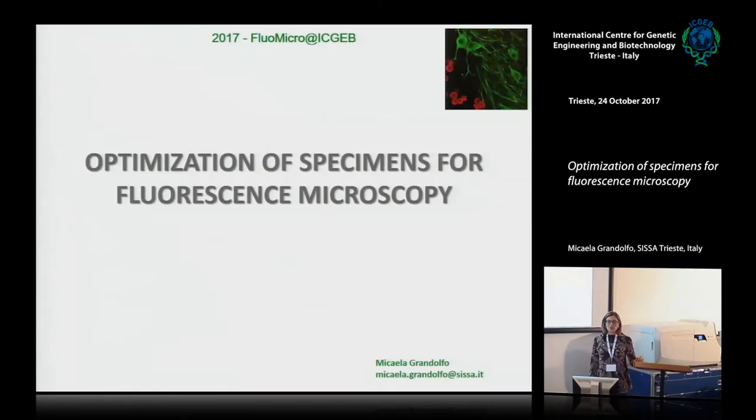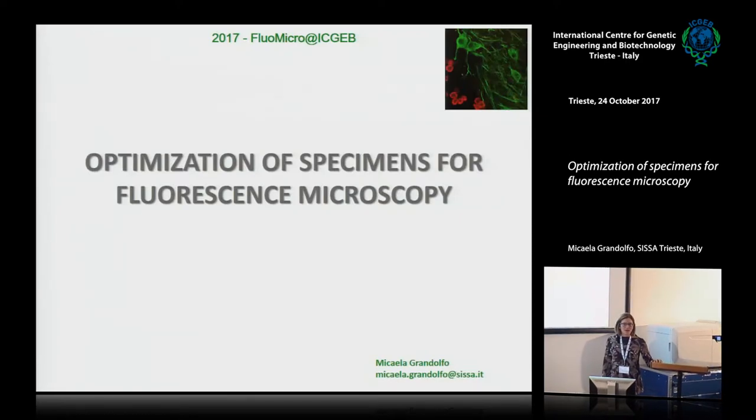Okay. Good morning, everybody. My presentation will be very short, very basic, very technical. So I would like to give you some basic tips and tricks to obtain a good specimen for fluorescence microscopy.